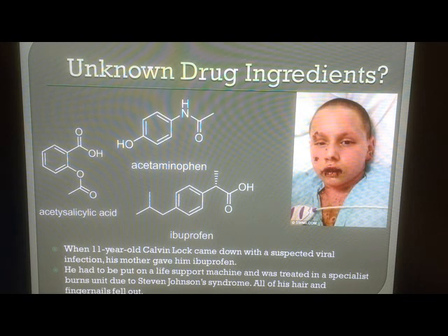That's something that you're going to be using a lot, especially next semester when you work on a synthesis project where you'll have your own target molecule that you get to pick and will want to synthesize from scratch. In the course of that synthesis project, you'll be analyzing your reactions and your reaction products a lot by TLC.